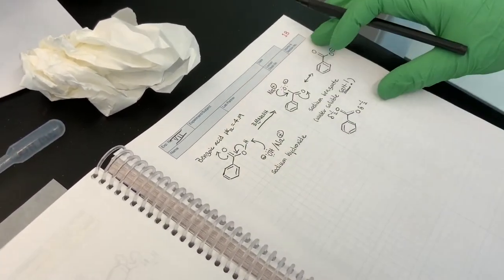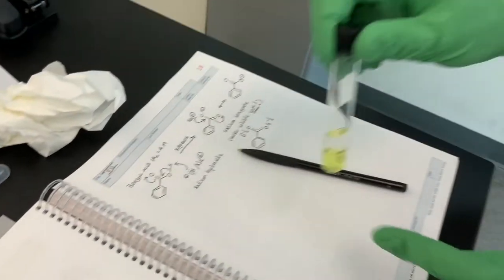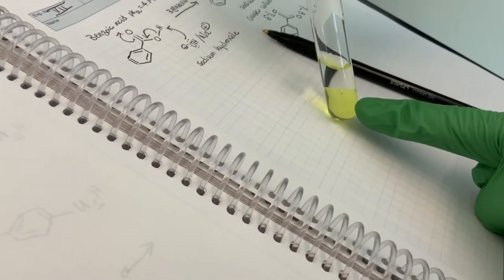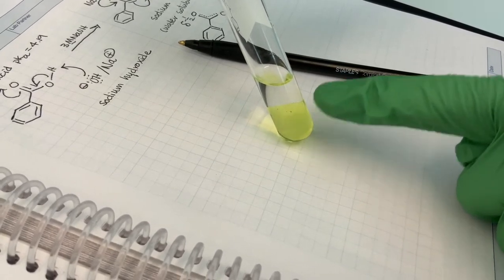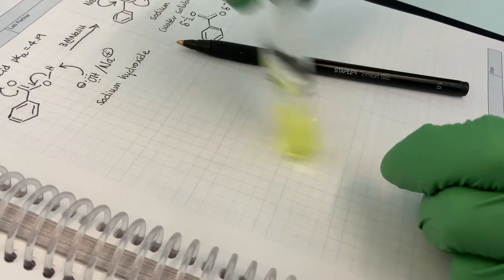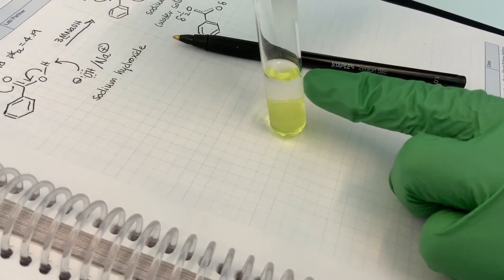So anyway, this is the acid-base theory going on, right? And the emphasis is now that this sodium benzoate is water-soluble. So only our neutral 9-fluorenone now should be dissolved in the lower organic layer, the methylene chloride, and now in our basic layer, after the proton transfer events, which I was doing when I was mixing this, in the top aqueous layer, our top basic aqueous layer, should now just be sodium benzoate.